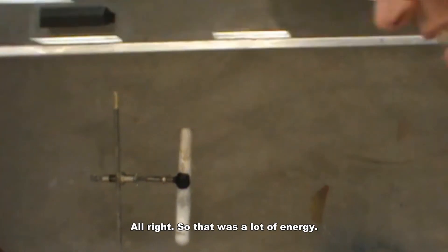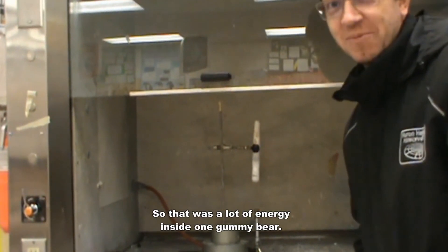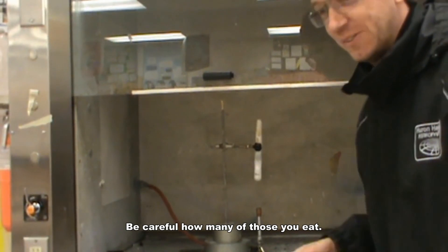Alright, so that was a lot of energy. That was a lot of energy inside one gummy bear. Be careful how many of those you eat.